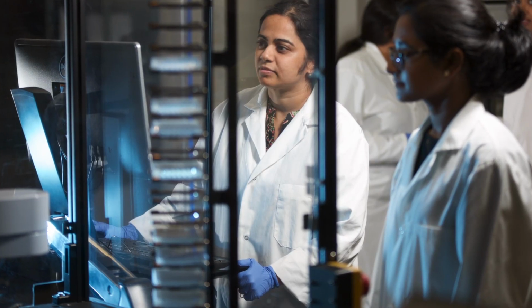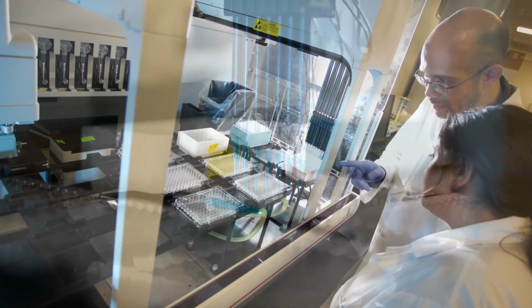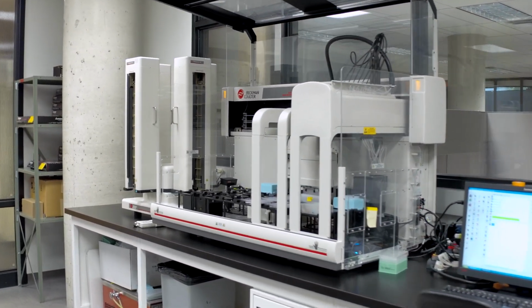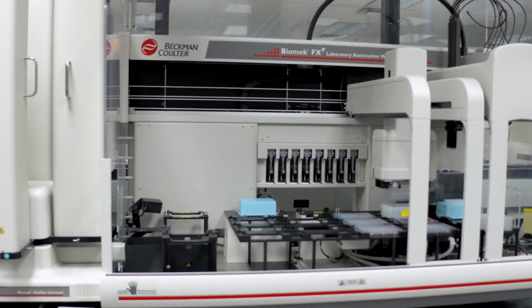The fund that we receive from the National Research Council is to help us upgrade the Genome Foundry technology platform so that we can manipulate mammalian cells, and more specifically stem cells, to develop a human health and therapeutics aspect of our research program. The Genome Foundry is really a technology platform that lets us accelerate the manipulation of DNA and living organisms. And we do this using a design step, a build step, so modification, genetic modification of the DNA of the organisms we're looking at.